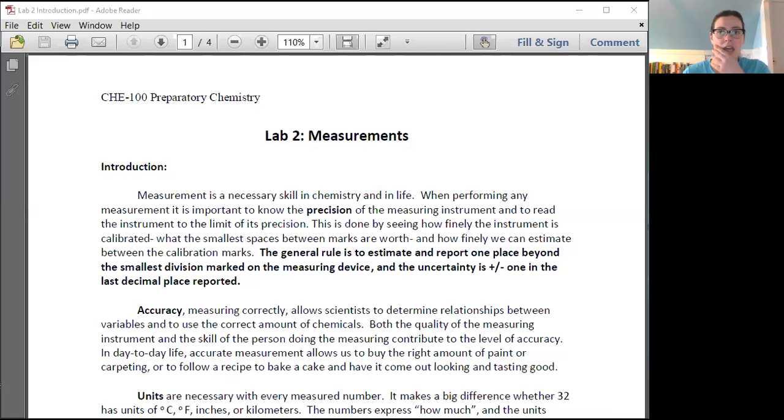And this handout we're just going to go through, and then there's actually two handouts for this lab, one for the introduction and then one for collecting data, just to be very specific on where your data collection instructions are. So when we're looking at taking measurements in the lab, the thing we have to be really careful about is not just what number you're throwing down on your data table, but what precision you're using to record that data. It should match the precision of the instrument that you're using.